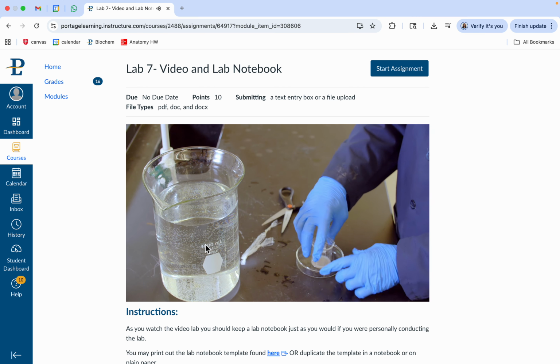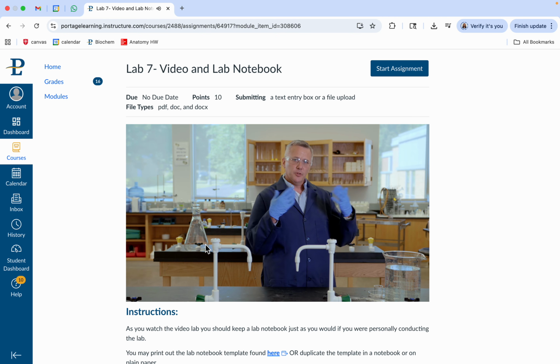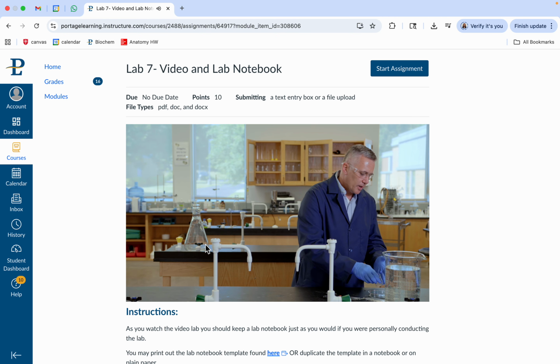All right, so this is the solution. This is what we're going to refer to as our AS2D, so ammonium sulfate 2 dialysis. When we put it in there, we called that AS2, that was ammonium sulfate fraction 2. That was sort of what we went with. And so now it's been dialyzed. We've gotten rid of the salts.